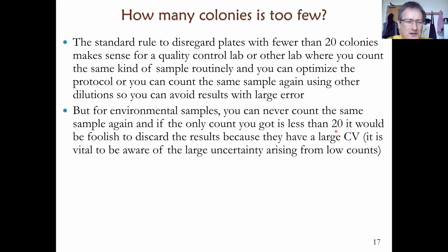Remarks and additions. So we should include counts from all dilutions as long as they are countable, so the plate isn't too full. Also include plates that have a low count, because they have some information, and let's use all the information we can.